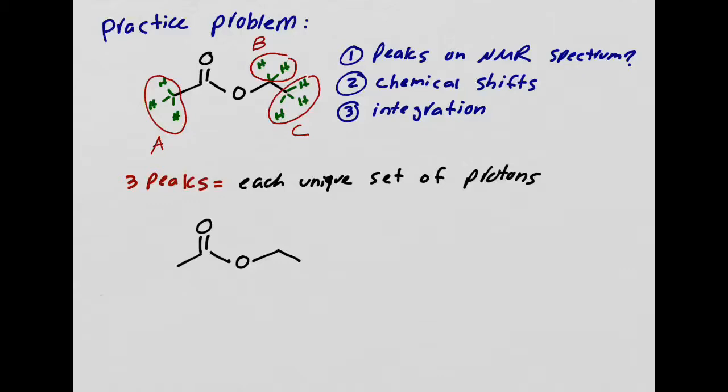Number 2, now the chemical shifts. Remember, I gave you a little handout and I'm going over that handout, so take advantage of that. Again, remember what we talked about. We have unique hydrogens over here, here, and here. Now, these hydrogens are attached to a carbon, and this carbon is attached to a carbonyl. Do you guys remember this?